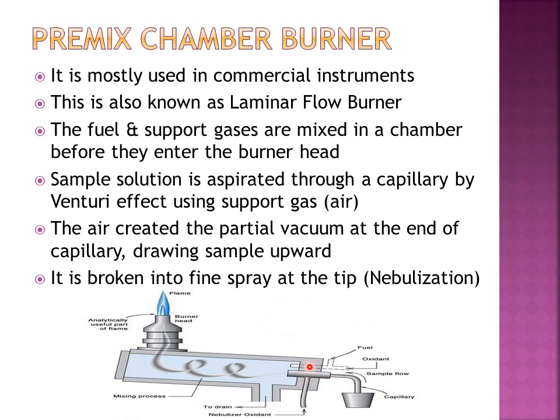Then there is the nebulizer, so the sample is broken into a fine spray. So here is the phenomenon of nebulization. All of these components, fuel, oxidant, and sample, are mixed well in this chamber before they enter the burner.